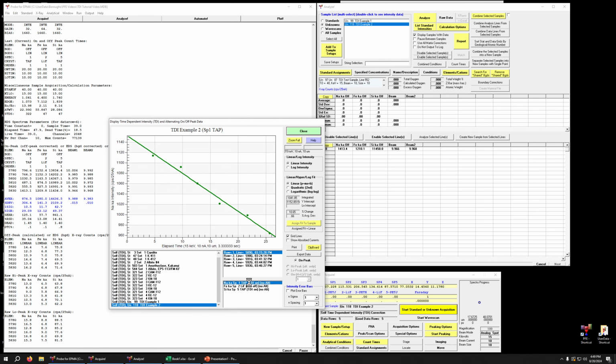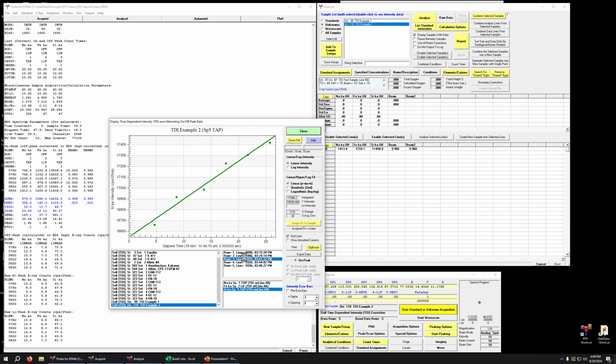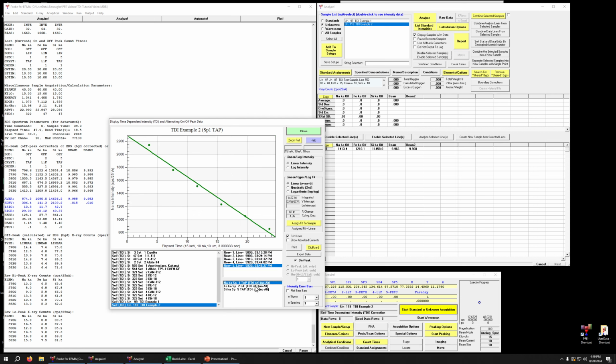Conversely, let's say you want to assess one sample but a bunch of different elements, so you can bounce through those or look at different lines for the same element. And it remembers your choices as you go to do this, so it keeps it silica all the way through so you can look at them, or sodium, whatever you pick. Another nice thing about this is it has done a few calculations here for you, so you can see the magnitude of the changes you're looking at.